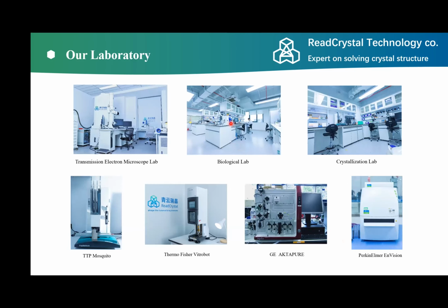This is our lab in Suzhou. We have purchased our own transmission electron microscope. This microscope is optimized for micro-ED application, and I think so far it's the only TEM in China that works only for micro-ED. So all the accessories and the whole workflow are optimized for micro-ED application. We also have a biology lab and a crystallization lab, to prepare the protein sample and to crystallize the protein and small molecules.